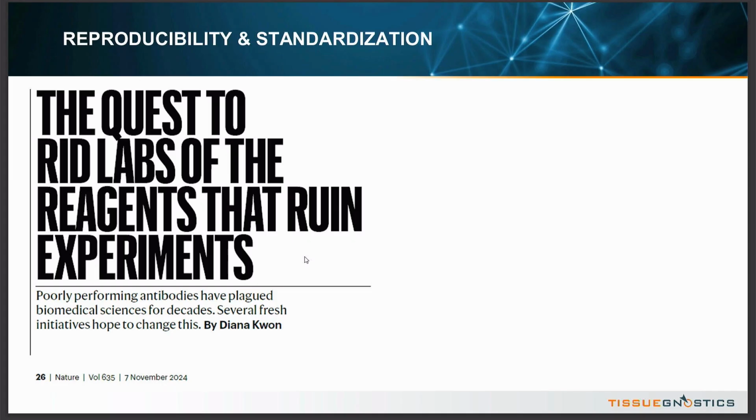But we have to always keep in mind that software can do a lot, like increase the contrast, remove the background, make spectral unmixing and so on. But the basic is always our experiment. And if the experiment doesn't work, don't expect the software can give you good data.